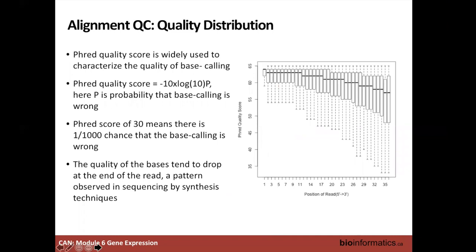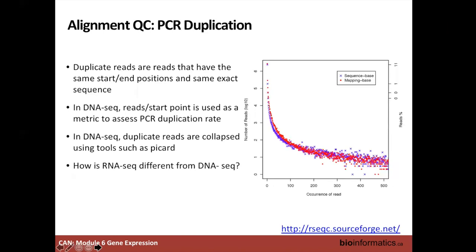Another thing to check is the quality of base calling, assessed using the Phred quality score, which is -10 × log10 of the probability that the base call is wrong. A Phred score of 30 means there is a 1 in 1,000 chance the base is called incorrectly. You want Phred scores above 30. A good quality plot shows scores consistently high — even above 50 — all along the read from 5-prime to 3-prime end.